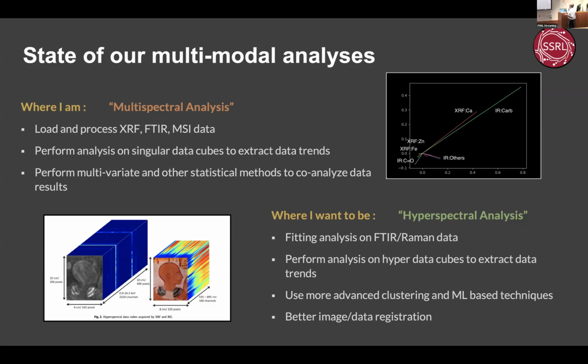And that's great. We can do things that we'll show you later on, where we can compare how the data from my infrared corresponds to my XRF, and what variables I've analyzed, how they relate to each other. And that can be a really nice way of doing things that's not just, again, overlaying images in PowerPoint.